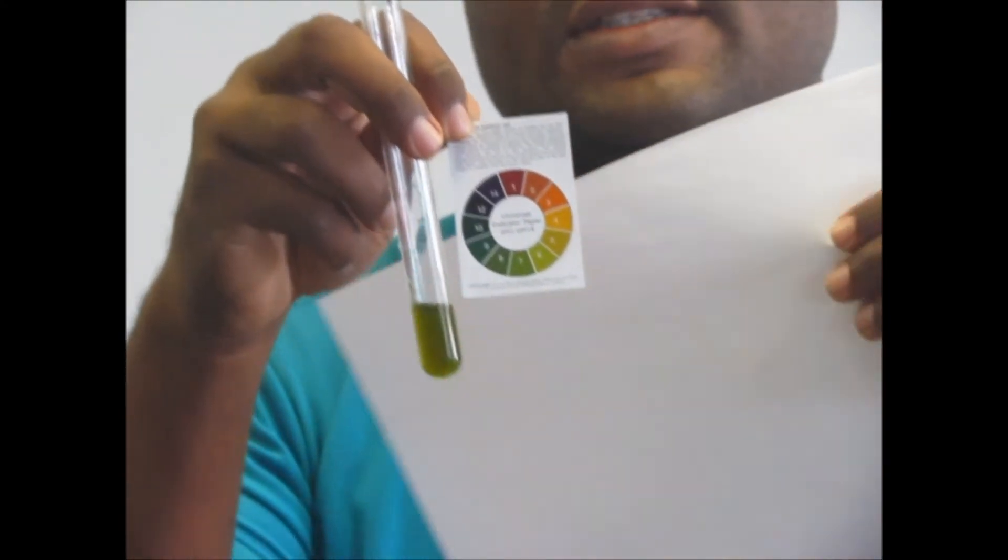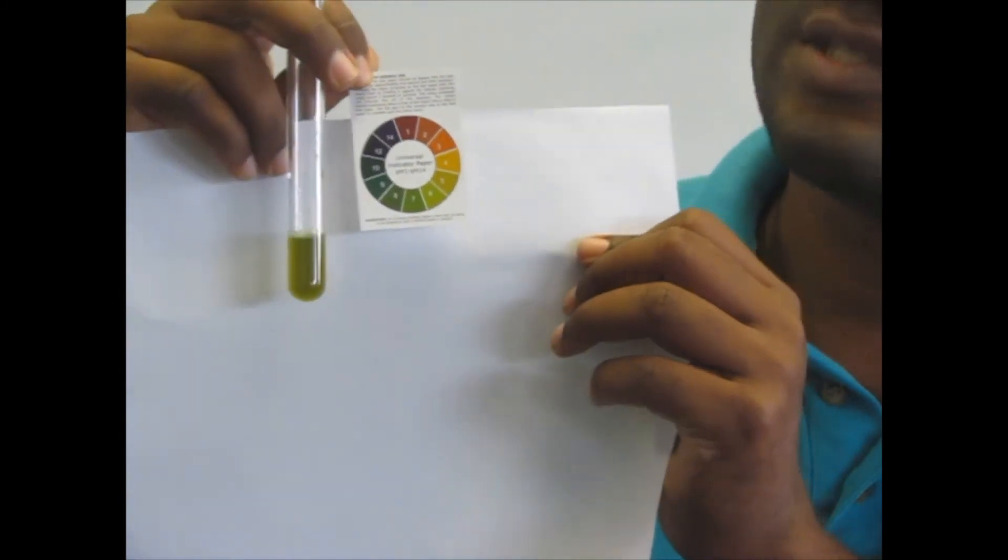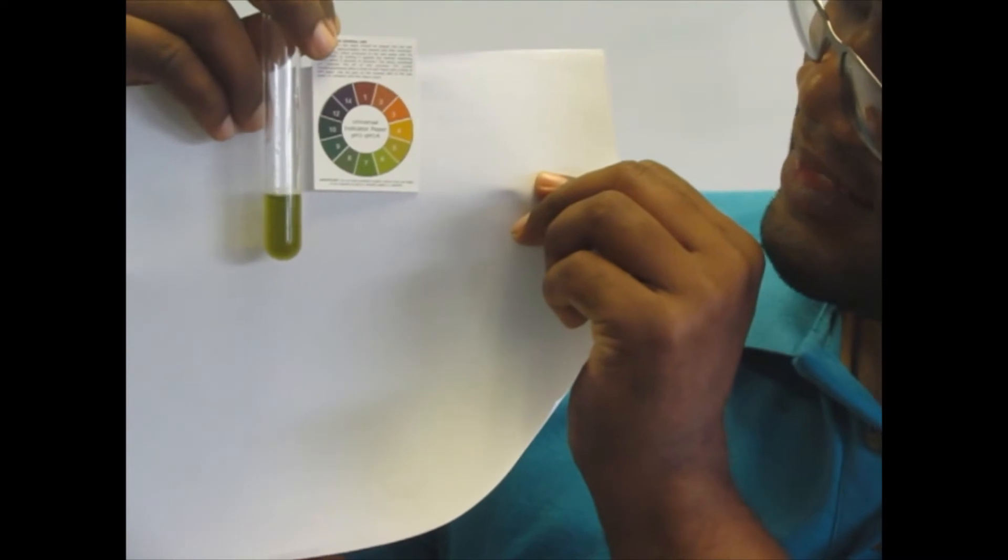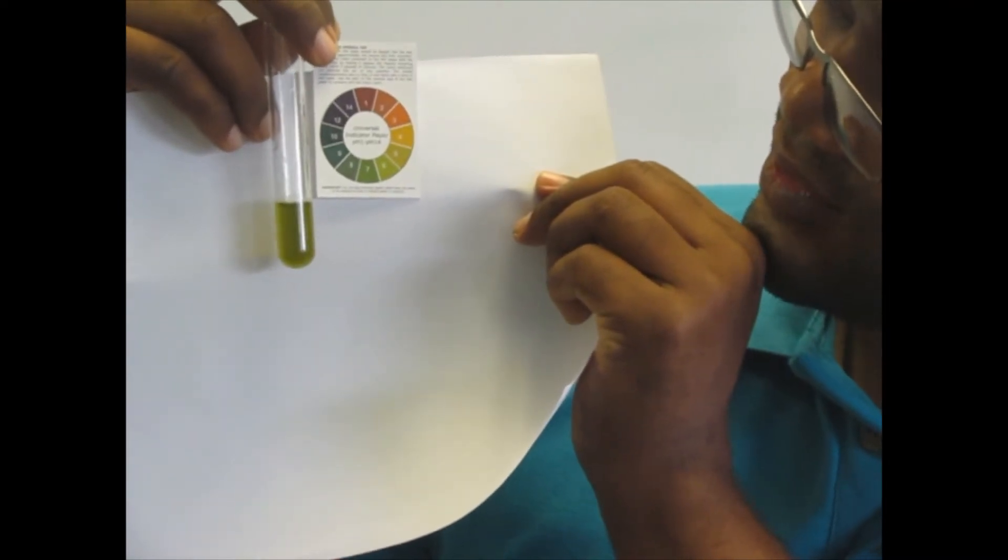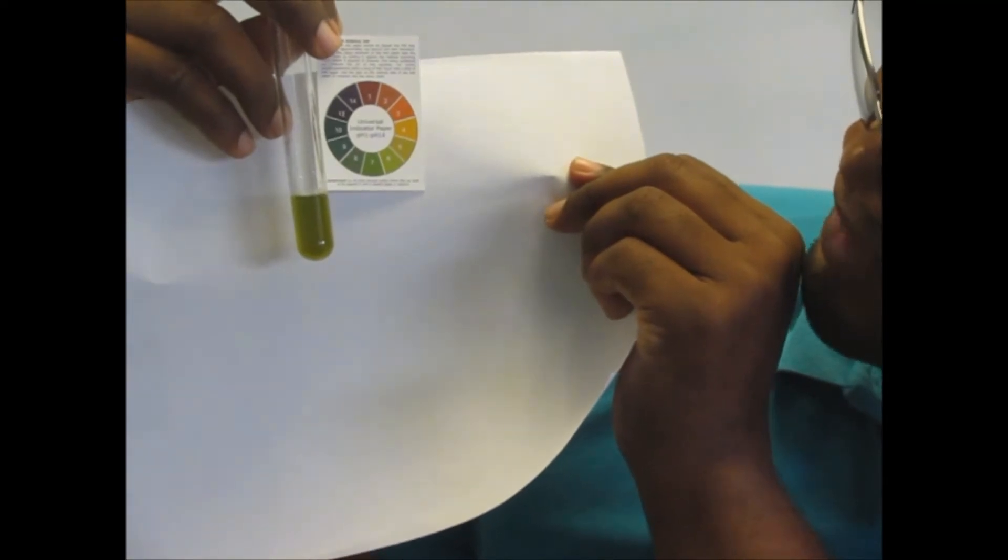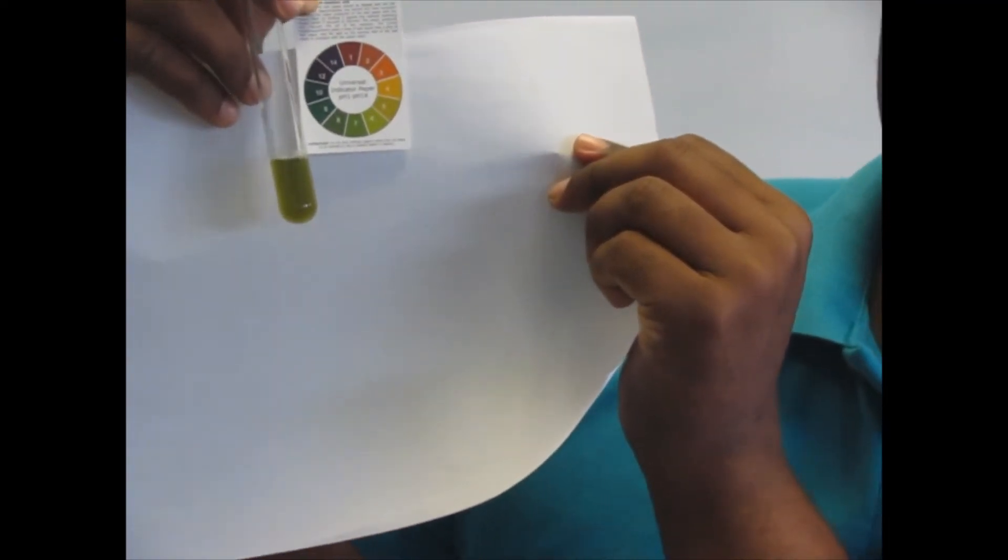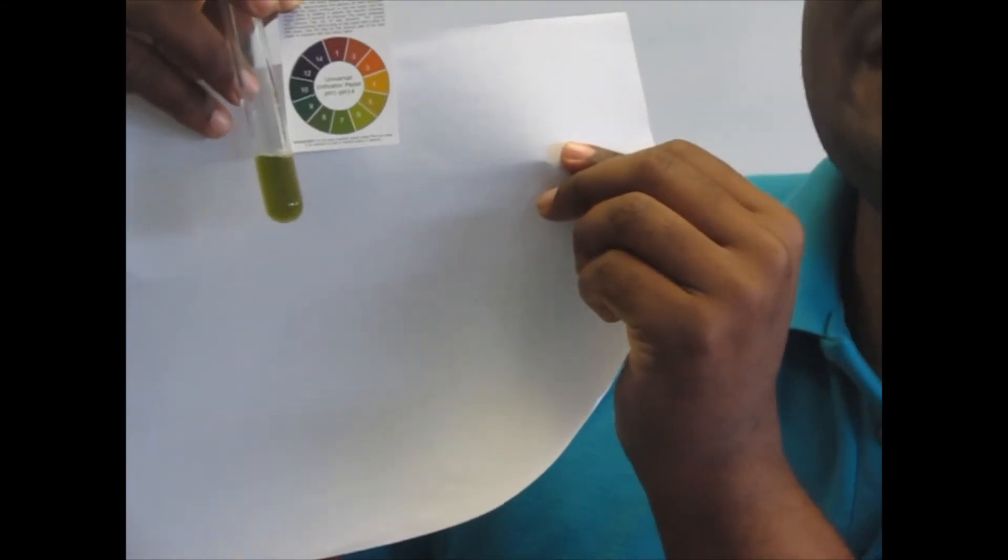What you can do to do this is put up white paper behind the test tube, so that we can more clearly see the color. So this one is about pH 5 or between pH 5 and pH 6. This will be a slightly acidic soil.